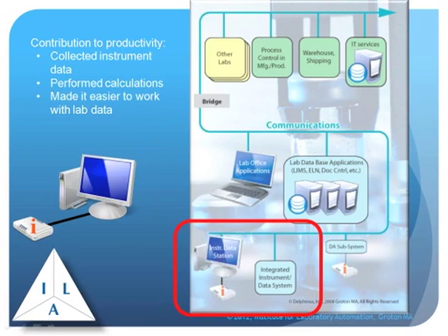So we can look at how, in terms of data systems, the equipment lays out. And the system we just looked at, the computer and the instrument here, would sit on the lab bench. But that's being replaced. In today's systems, we still have those available, but we're also looking at either integrated data systems and computers where everything is really in the same set of skins, or a distributed approach to data acquisition using subsystems.